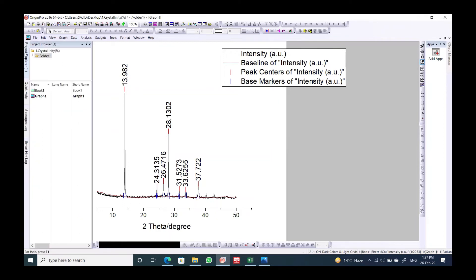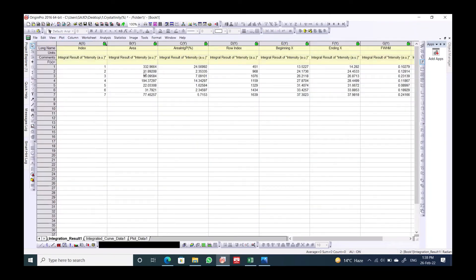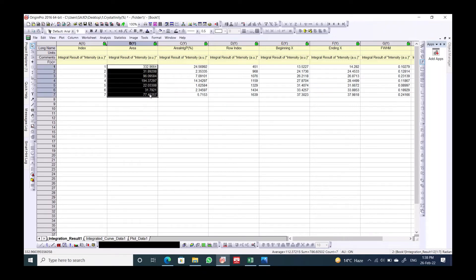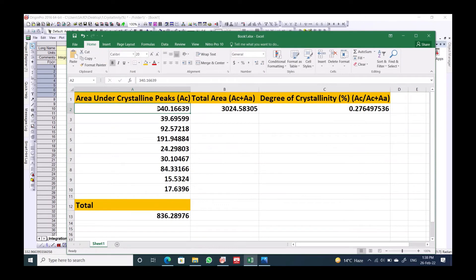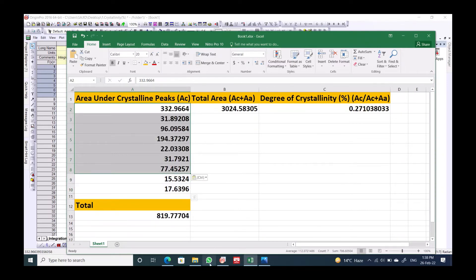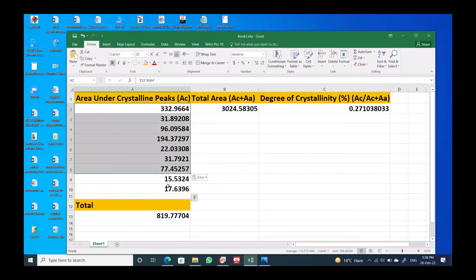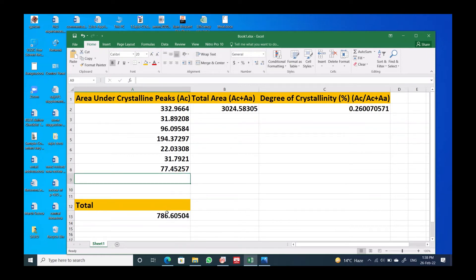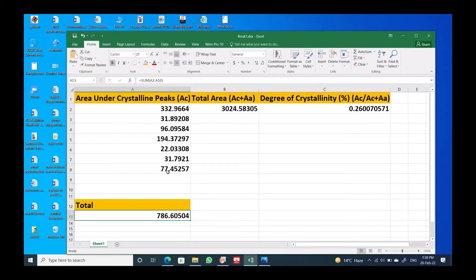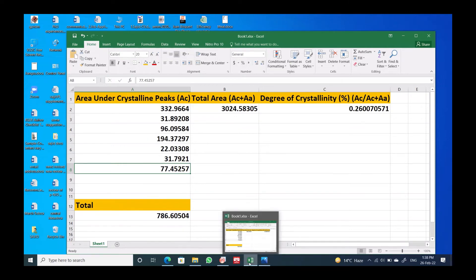Now we can see the integration of the selected peak areas. Go to the results book — the integrated areas are shown in the second column. Copy these values and paste them into an Excel file. This is the total area of the crystalline peaks. Use the SUM formula from A1 to the last row to get the total crystalline area.